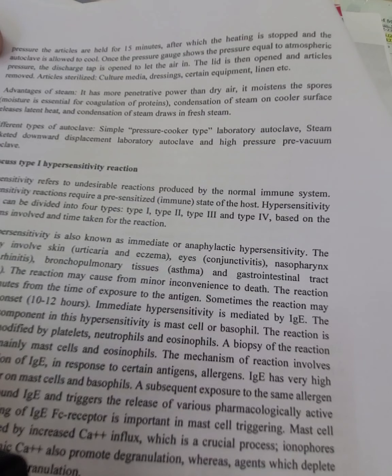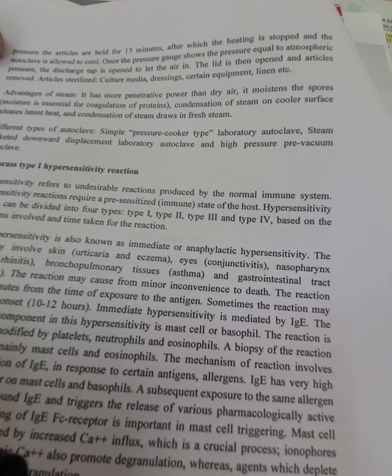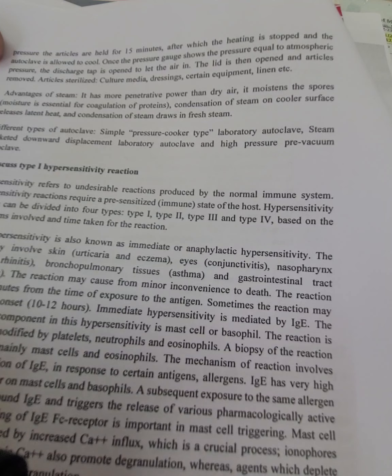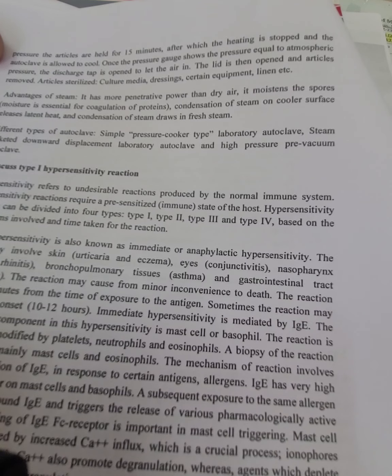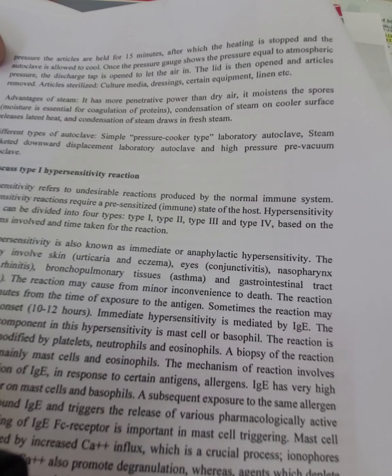Hospitals have huge autoclaves. Advantages: it has a penetrative power. Steam has got a penetrative power and it gives a lot of heat after condensation. Various types of autoclaves are used. A simple example is the pressure cooker, which you use in the house for the preparation of rice.